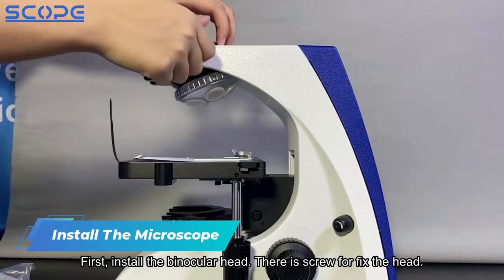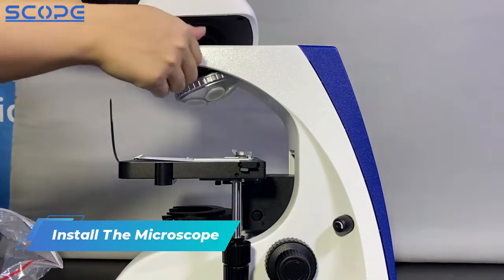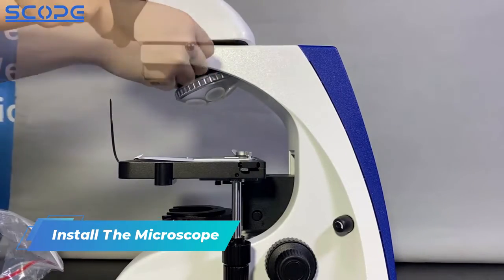First, install the binocular head. There is a screw to fix the head.